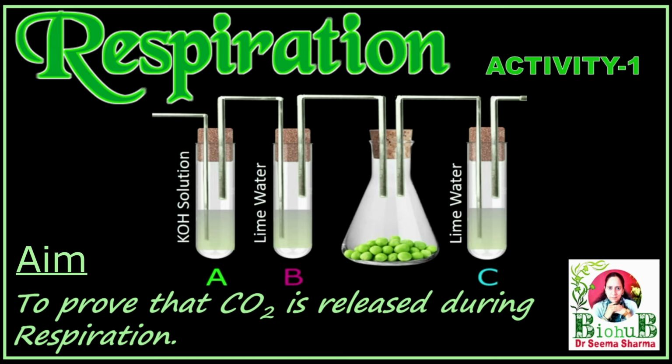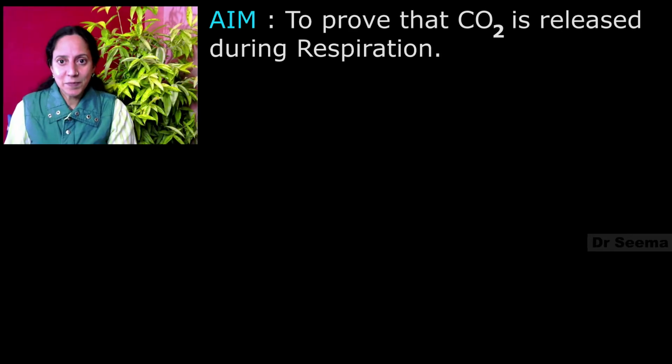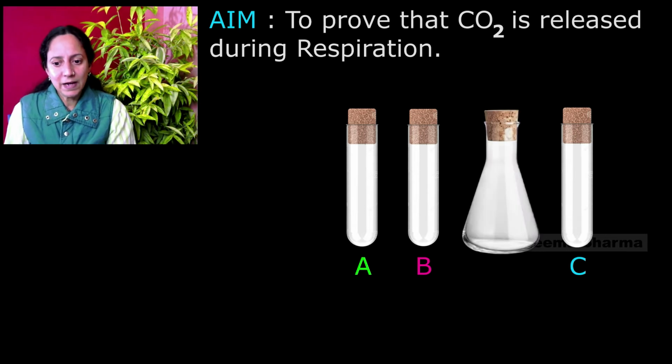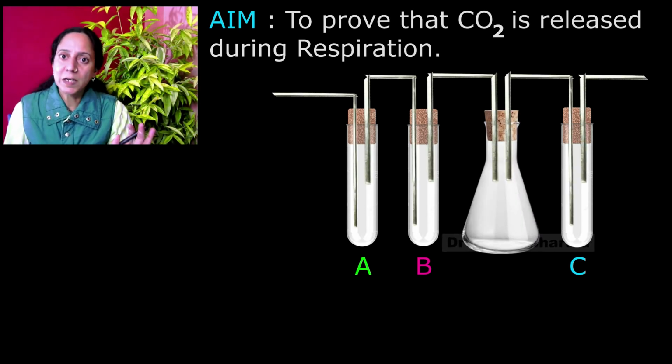Hello viewers, the aim of this activity-based video is to demonstrate that carbon dioxide is released during the process of respiration. Let us see the experimental setup first. In this experimental setup, we have 3 glass tubes, 1 conical flask. It's an airtight experimental setup.